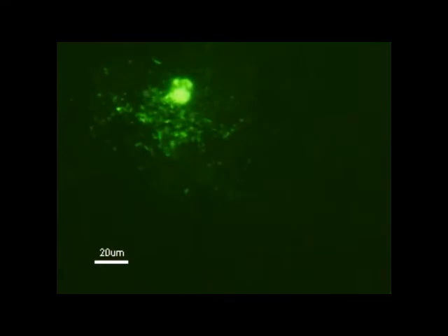You see all those small green images that are moving around furiously in the screen? Those are viable Legionella that have been caused to become fluorescent so that we could see them in the microscope.